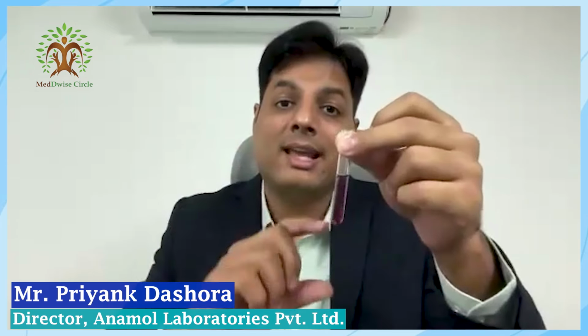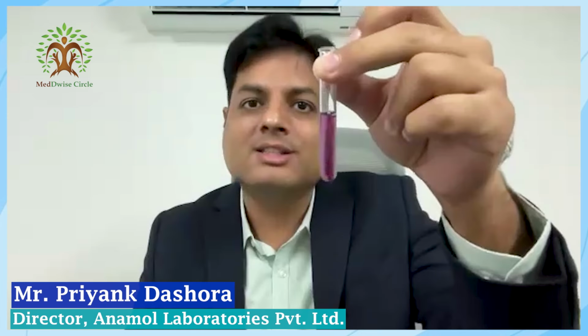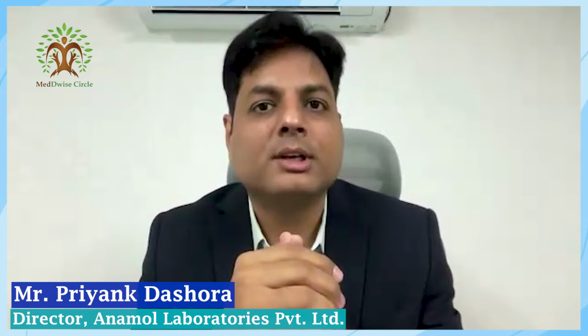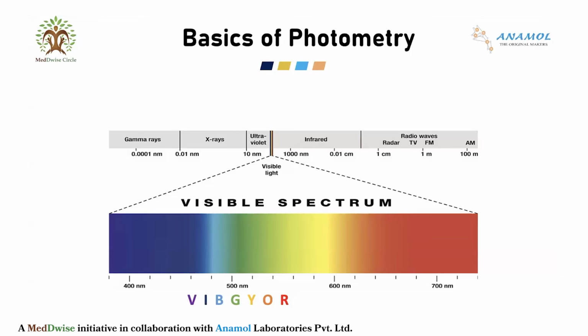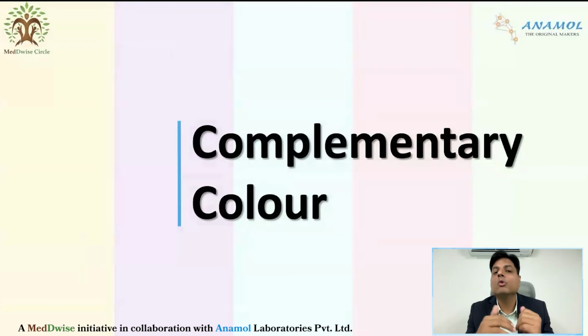Now, whenever there is a reaction, you can see that the color of the reaction is not transparent. It is of a particular color. Now, when we expose this colored solution in the path of light, it will absorb some amount of light. Therefore, we need to understand the concept of light. Now, we have to understand something called complementary colors. What exactly is a complementary color?